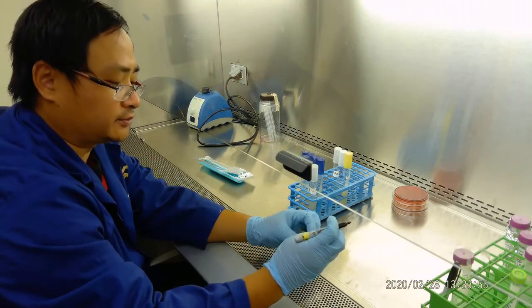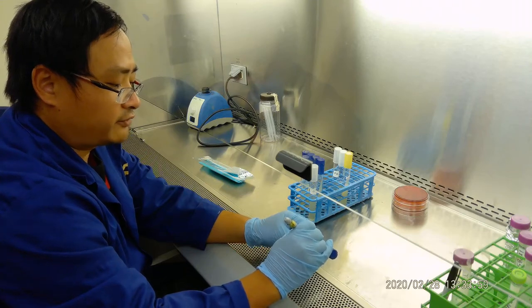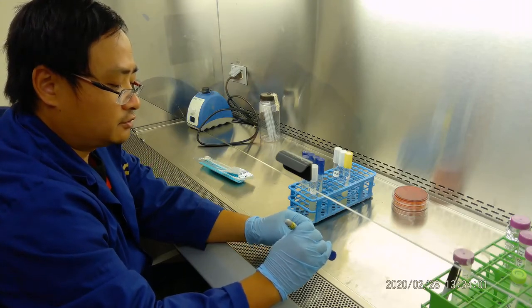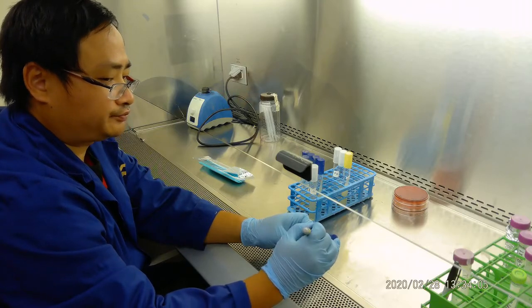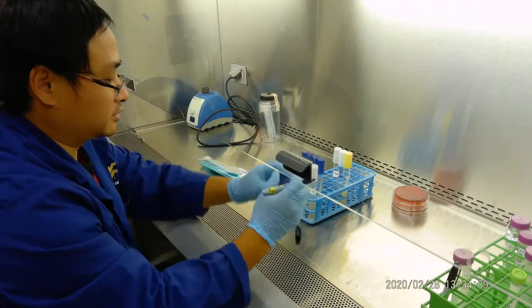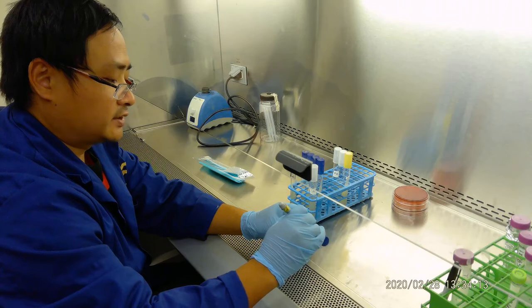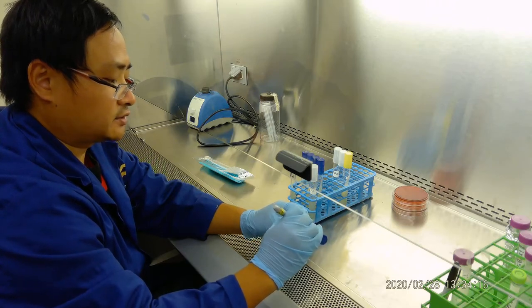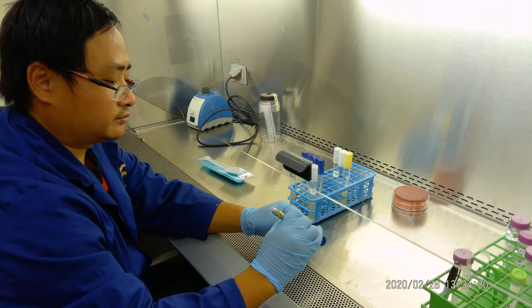So the first job of what we do is Serratia. We label at the bottom. We label SM, 25 degrees Celsius, the initial and your bench number. So let's take a picture right there. Okay. Now we do this first one, and we label the second one Serratia, 37 degrees Celsius, initial, bench number, and date.